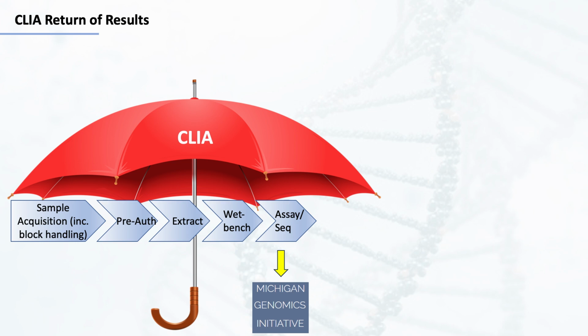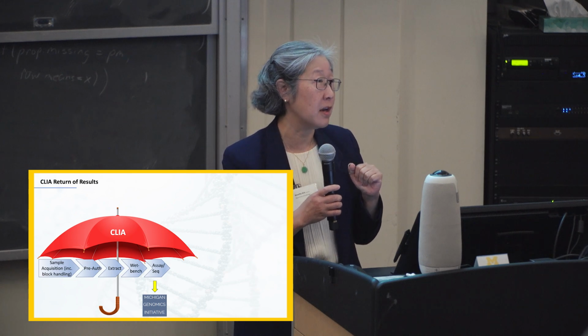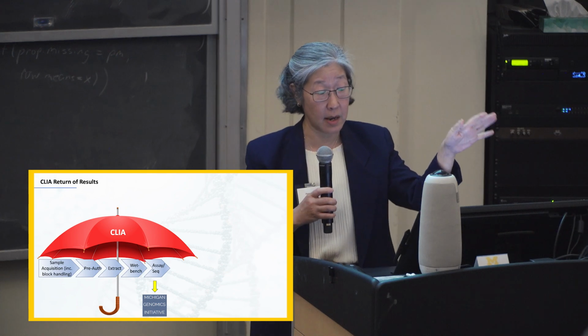So again, this would be a very large collaboration with Illumina. They would be partnering with us in order to enable a very rapid and inexpensive genome. One idea is that we would do all of the sequencing for MGI under the CLIA umbrella, and give the data directly to MGI. We have a couple of options. We can give FASTQs, or we could run it through the pipeline and give BAMs and VCFs. I think that's still a discussion that we need to have. But we can give all of that data directly to MGI.